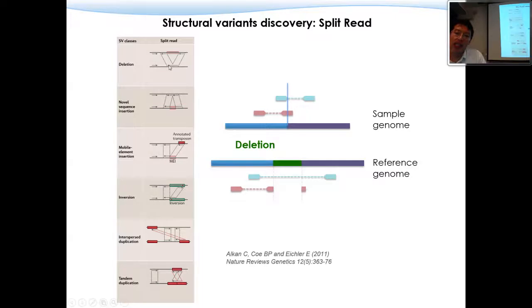Rather, and this is using one of the two ends. So you can see that when the structure variation junction occurred within these fragments, and then if you do the analysis properly, you will be able to identify those structure variations, right?